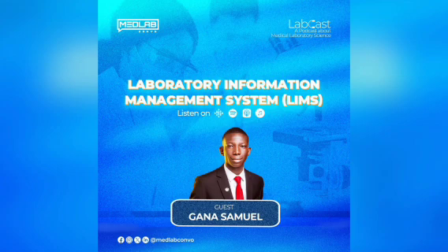That's one. Secondly, this is a series of processes. First of all, there is a command that the LIMS gives the machine, and the command acts as a query or a worklist, such that the data the system will send to the machine includes the sample ID and the test required. Now, what the analyzer will do is give feedback. The feedback it's going to give is in the form of the result of the patient.